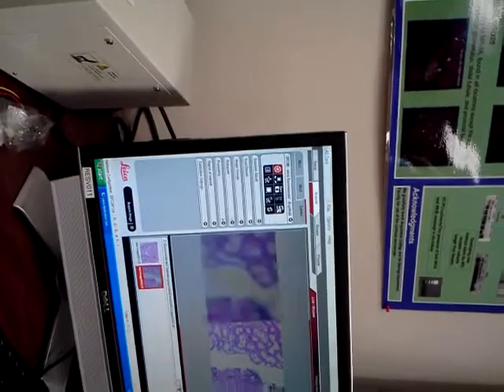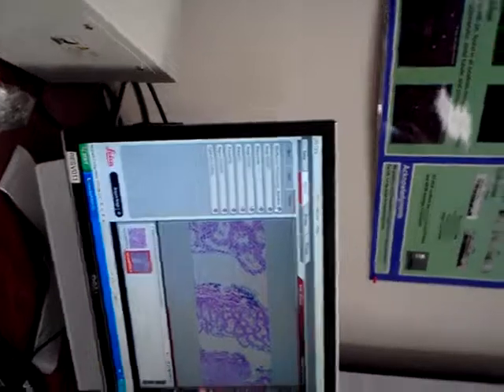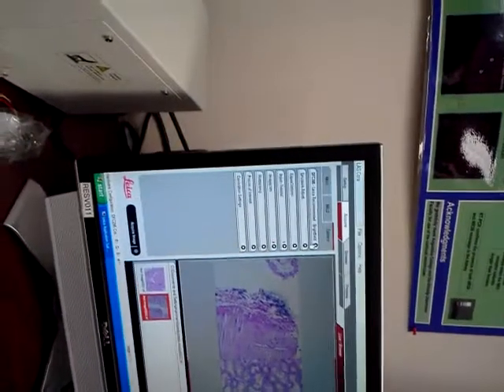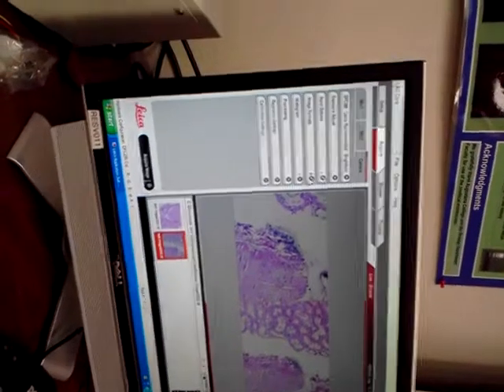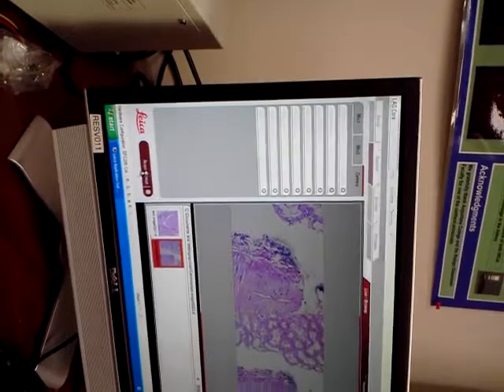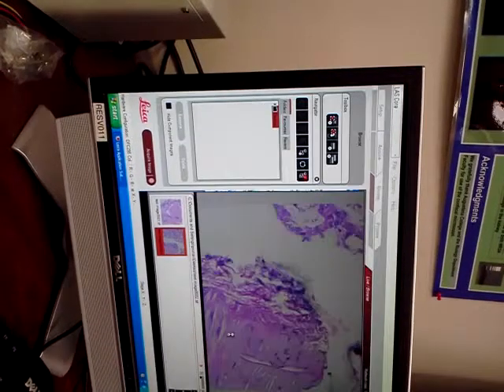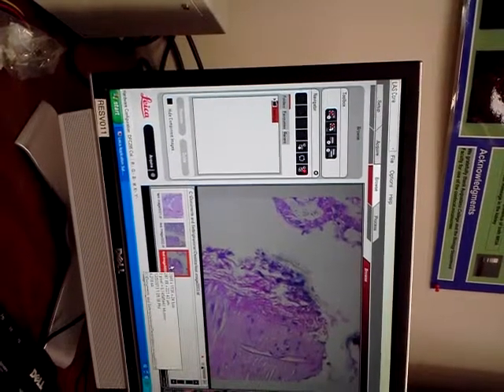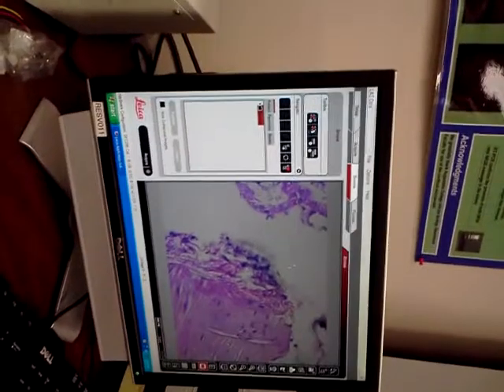I turned the auto off. That's cool. So then, say you wanted to zoom in right there, and then I will capture that. So I captured that one, and then now I can do the dual viewer.